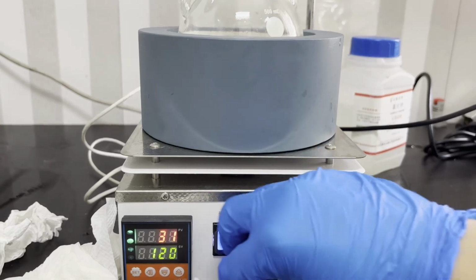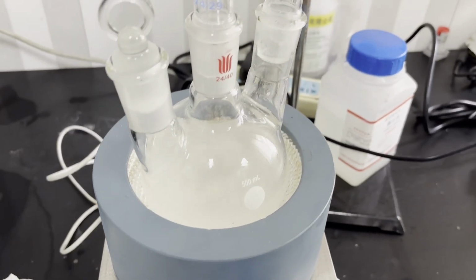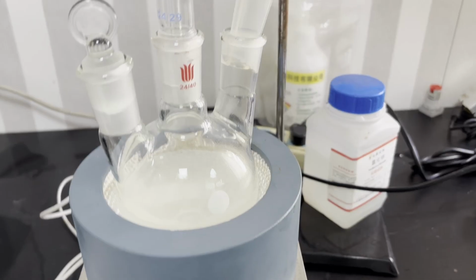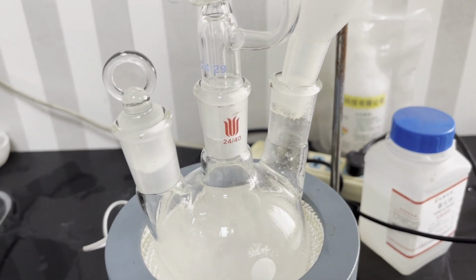With both N-butyl nitrite and hydrazine ready, the main dish of potassium azide can finally be made and served. 26.6 grams of potassium hydroxide is weighed out and dissolved in the hydrazine solution. Under strong stirring, potassium hydroxide dissolves rather quickly.